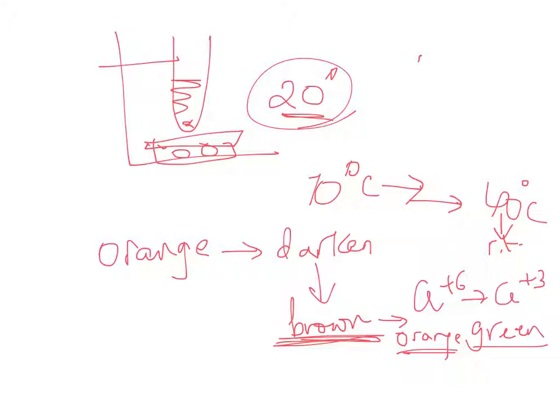At the end of 20 minutes, quench the reaction with oxalic acid—add about 100 milligrams into the reaction vessel. Oxalic acid takes care of any excess dichromate that might be left over. It undergoes oxidation to give CO2 and reduces all the dichromate. You'll start seeing a very clear green color.